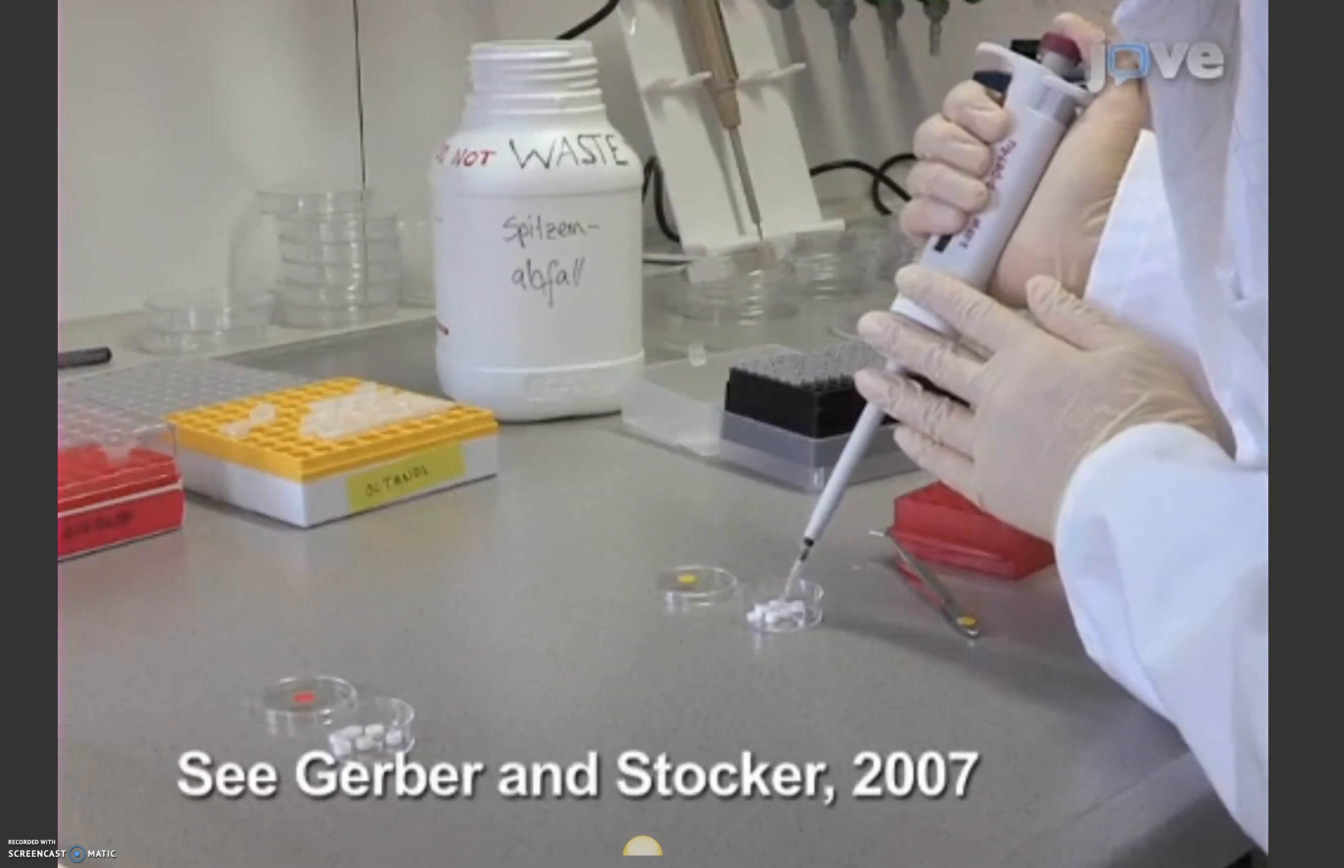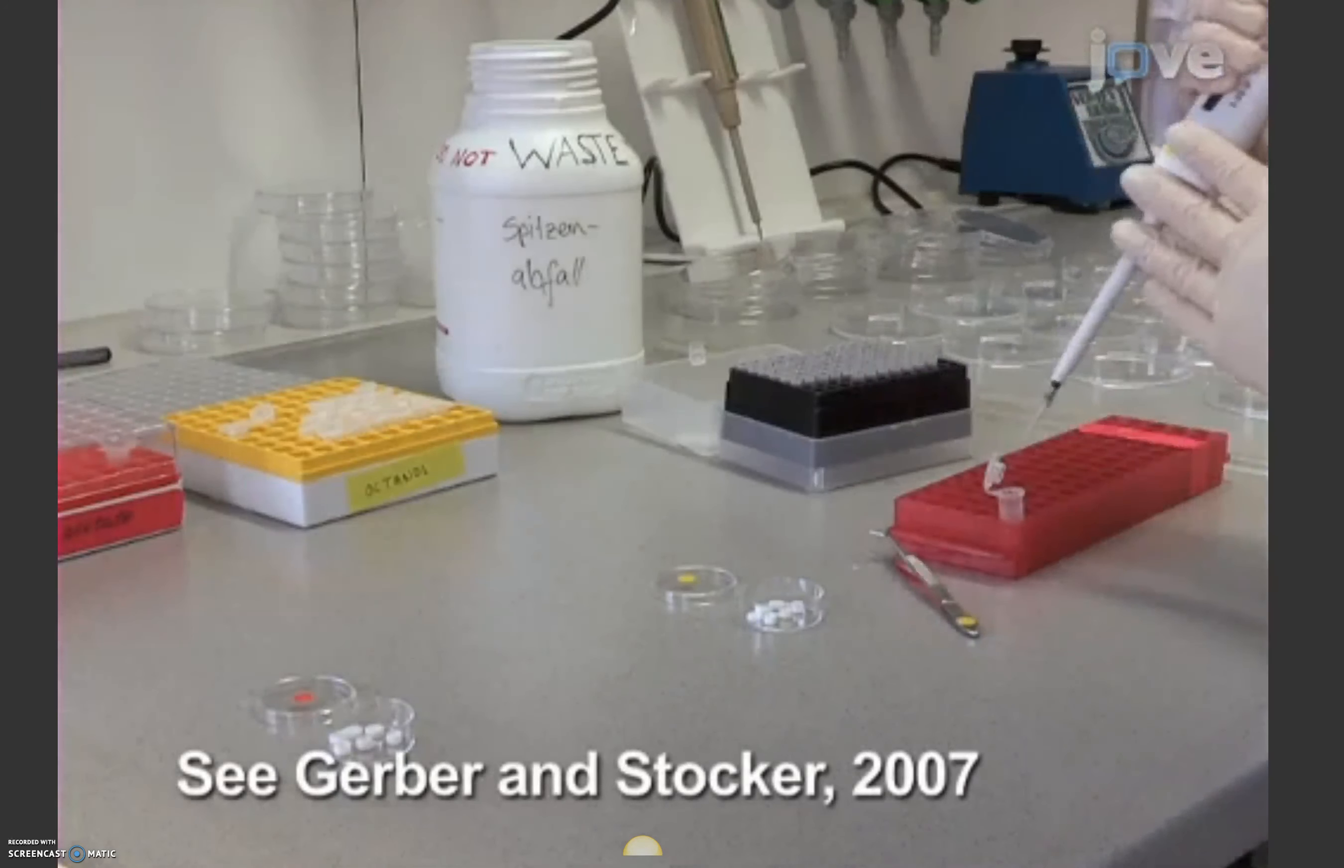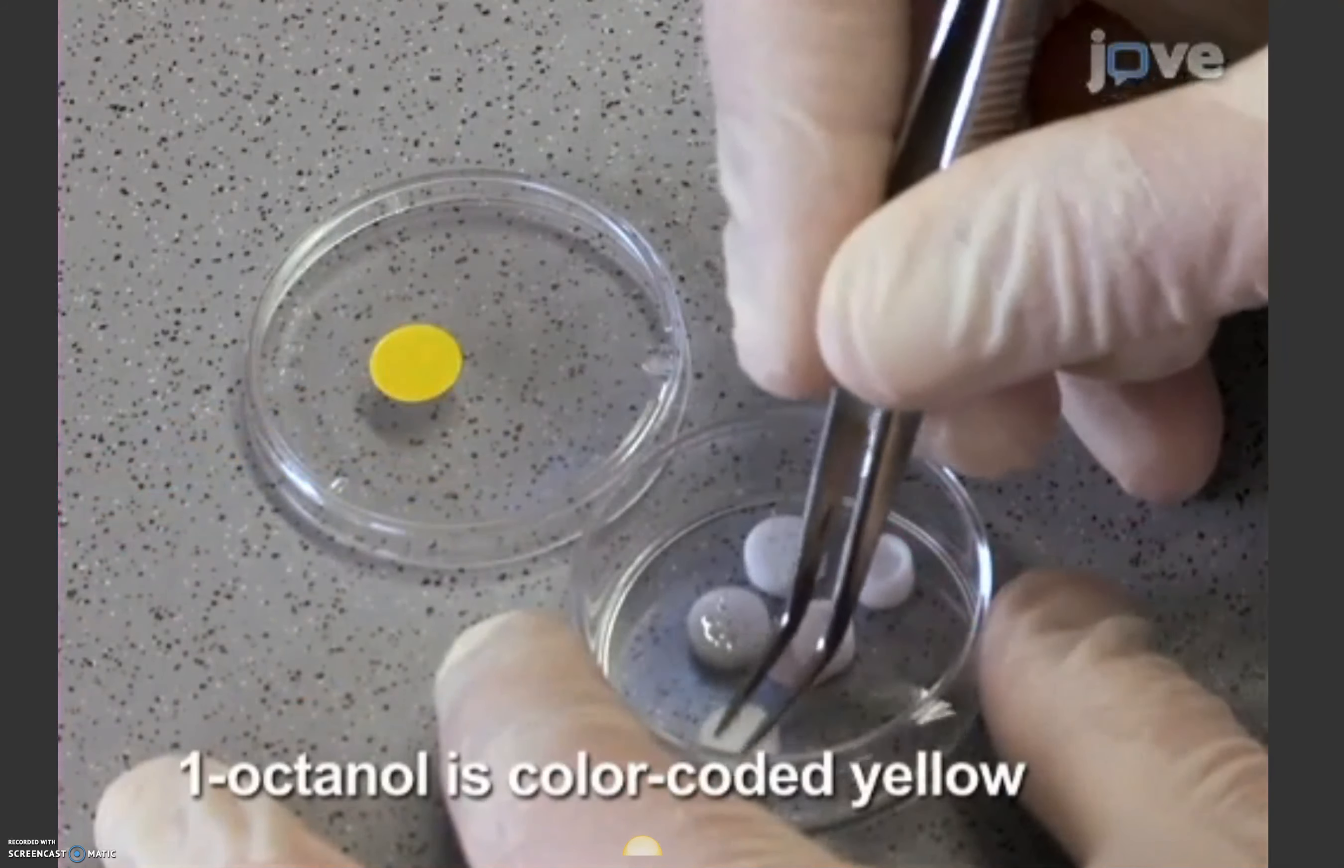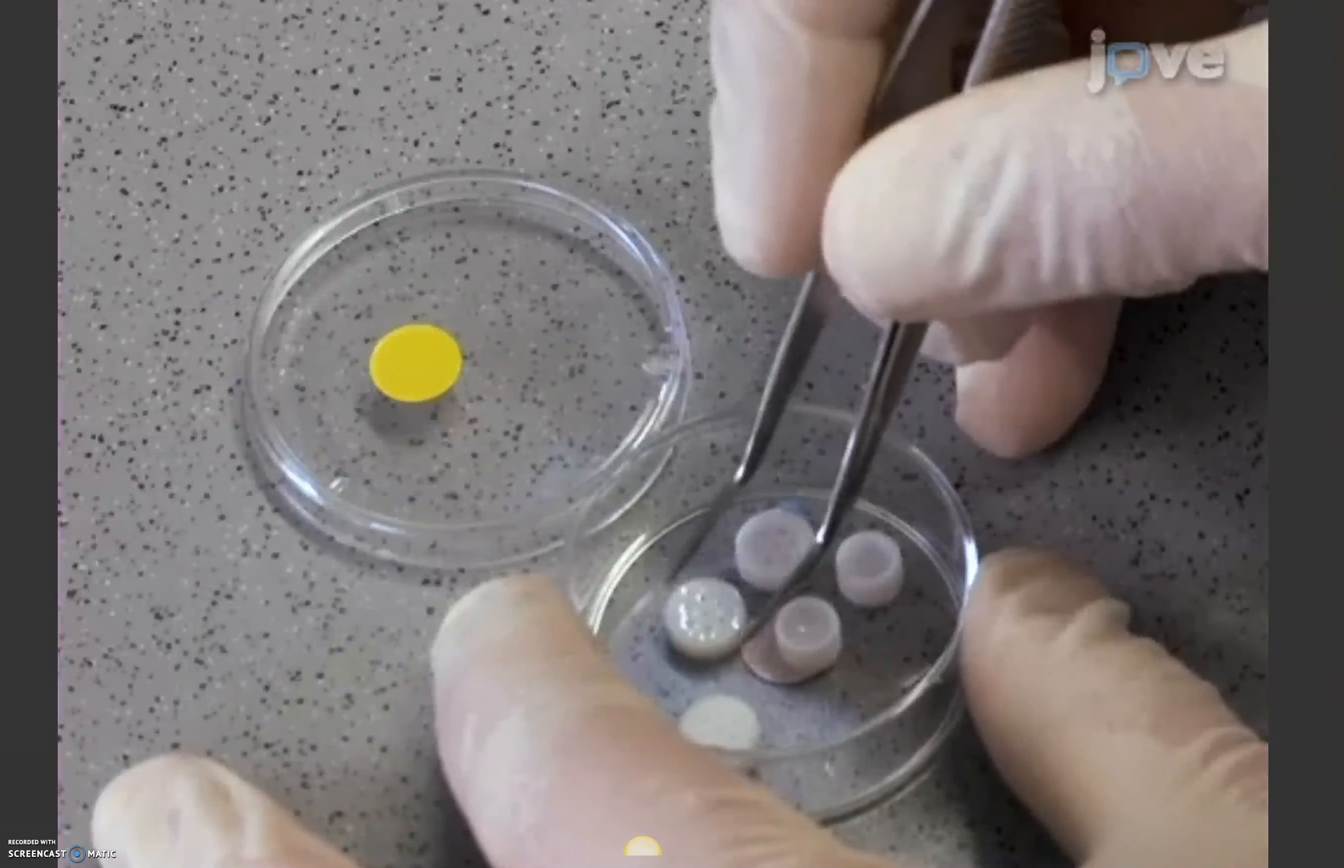For the conditioned stimuli, prepare a total of 3 customized teflon odor containers with 10 microliters of pure 1-octanol. The lids have small holes to allow for evaporation of the odor.